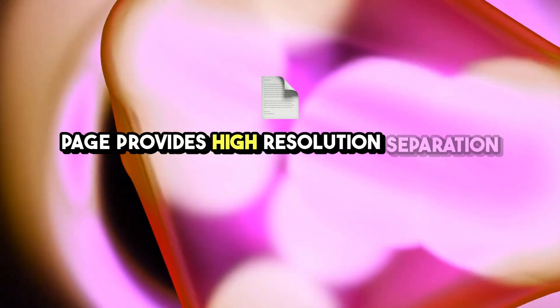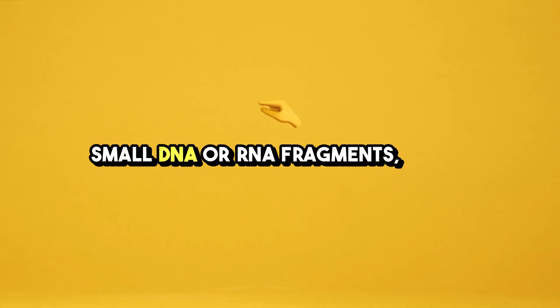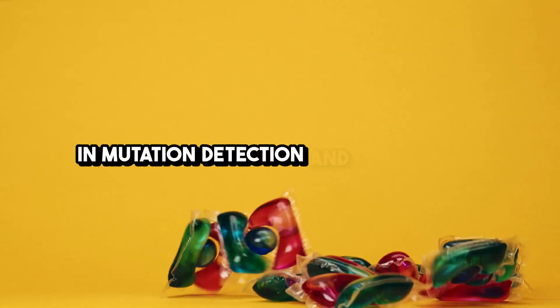PAGE provides high-resolution separation of small DNA or RNA fragments, aiding mutation detection and genotyping.